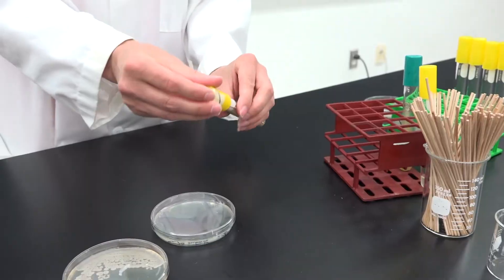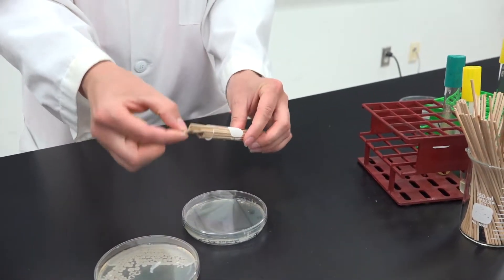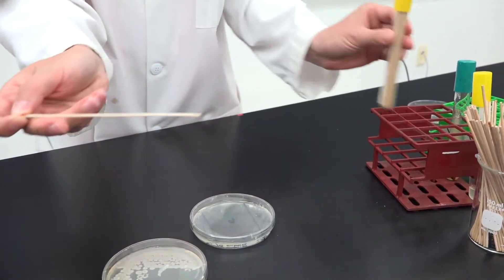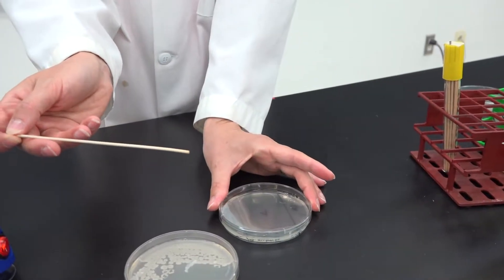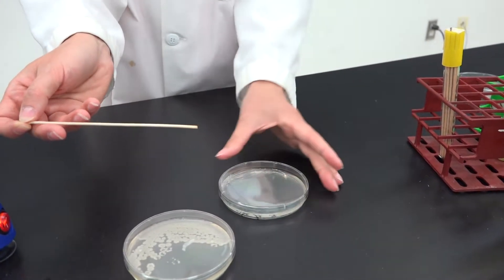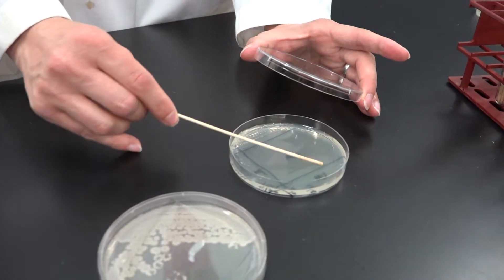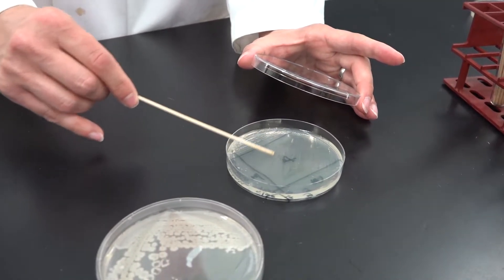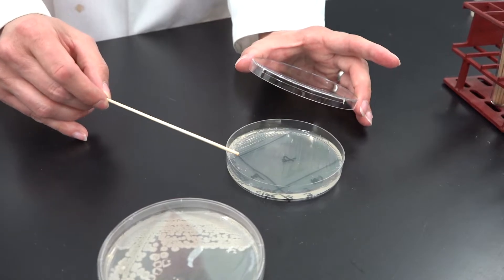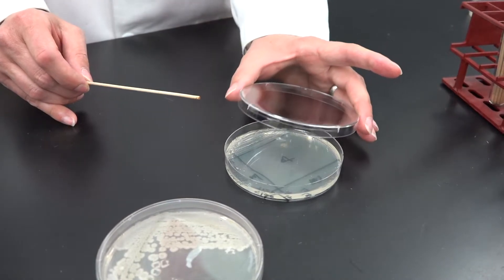Discard that stick and get a fourth and final stick from the tube. Rotate the plate 90 degrees again and take the bacteria from quadrant three and spread them in quadrant four. This time spread them out over the entire area without overlapping strokes. Do not touch quadrants one or two again.